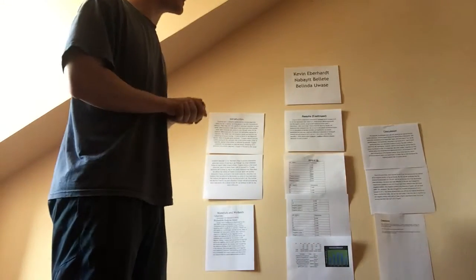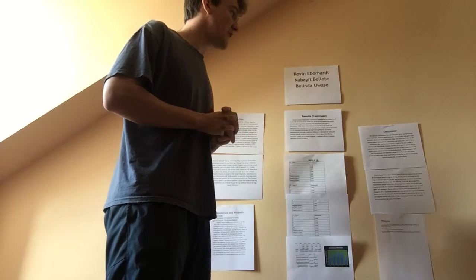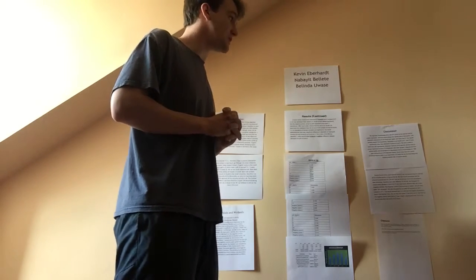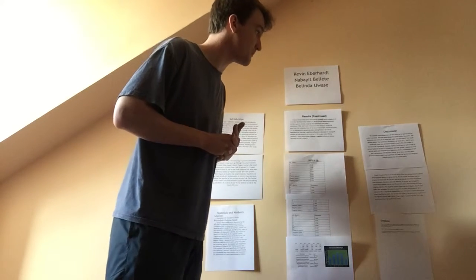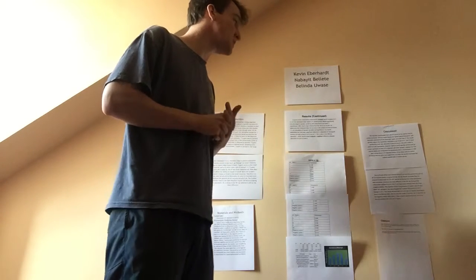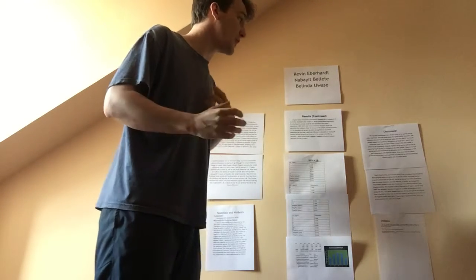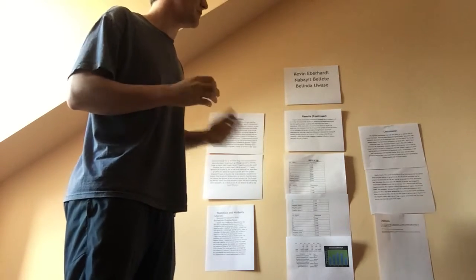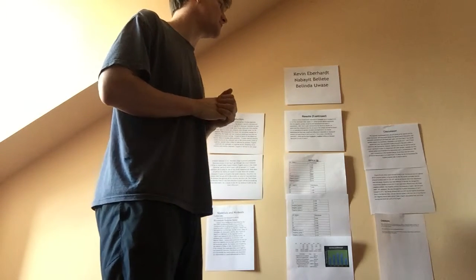So, moving on to the discussion. We originally hypothesized that a pH of 8 would be the optimal level for protein hydrolysis and thus would display the highest level of absorption. Our results partially support this hypothesis, as I mentioned before. We were not able to determine whether pH 8 or pH 9 was the optimal level.